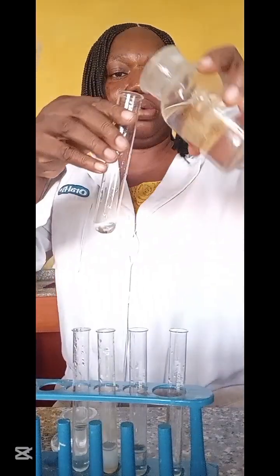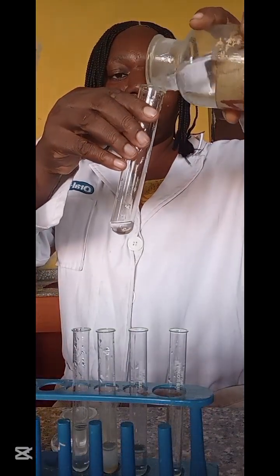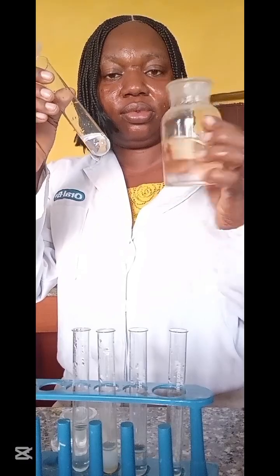Now, in ammonia, if it is calcium, it gives no precipitate. That's to show you that it's calcium. If you do all these things very well, you will have no issues. Know what the answers are before, then when you test it, it fits in.